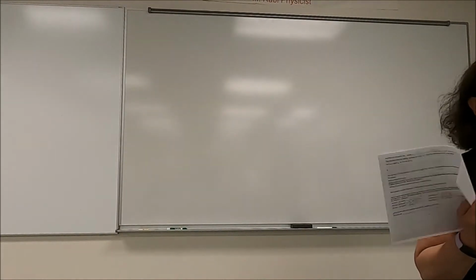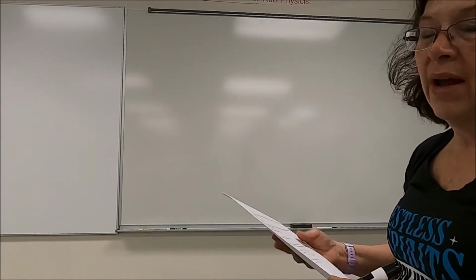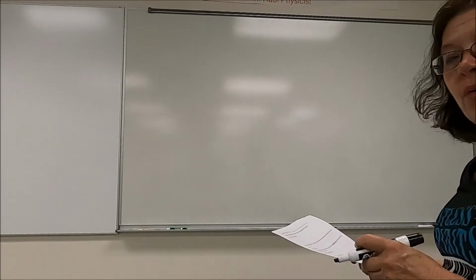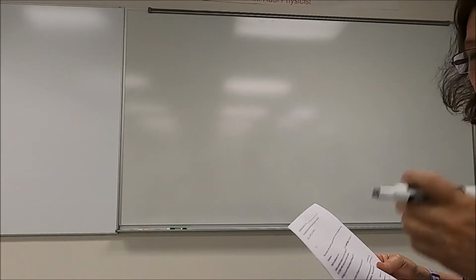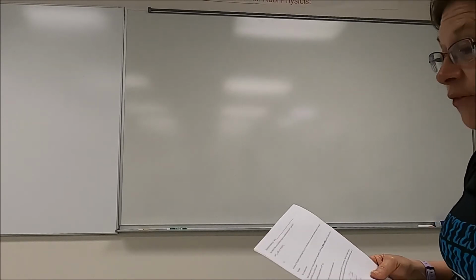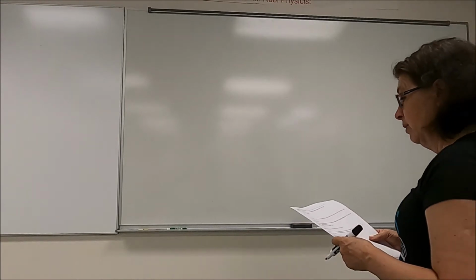Now this is another Spec 20 lab, and you've already seen me run through using the Spec 20. I had kind of a video disaster, and the camera ate the video, or I didn't push the button correctly. Who knows which one it was. So I'm going to run through the lab with you today and give you the data, show you how to deal with the data from this lab. You've already watched me use a spectrophotometer.